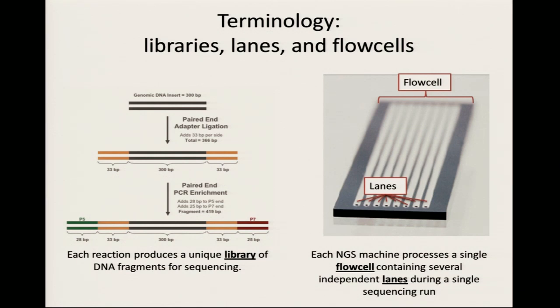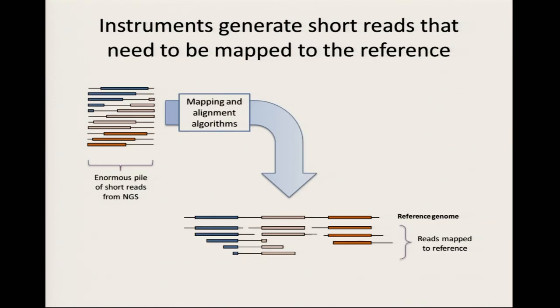So that's pretty important. Okay, so after you've done the sequencing, now you have to actually do something with this data, right? The first thing that happens is you take all these reads, and a read is just, we're reading off this fragment, and we have one little snippet of DNA. We have a pile of them. We have billions of these things, right? And they're tiny, and they're from all over the genome.